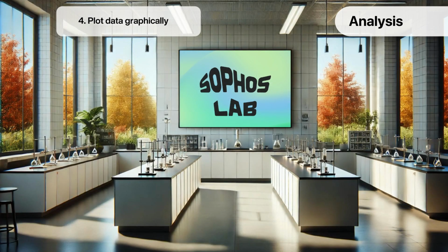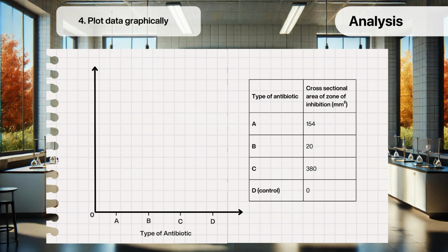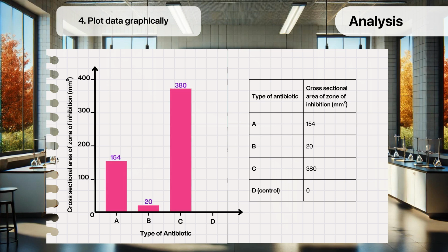Now, we take our data and plot the average area of the zones of inhibition on a bar graph. Use the different types or concentrations of antibiotics or disinfectants on the x-axis and the average area of the inhibition zone on the y-axis. This visual representation helps in comparing the effectiveness of each agent clearly.